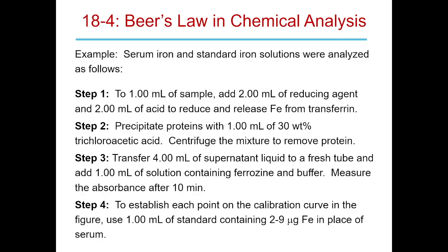So the standard does several tasks for you. It makes your Beer's law curve. Okay, remember that? And so you'll fit your Beer's law curve to this. But it also is what gives you the error of that Beer's law. So it's also checking, is that Beer's law fitting correctly?